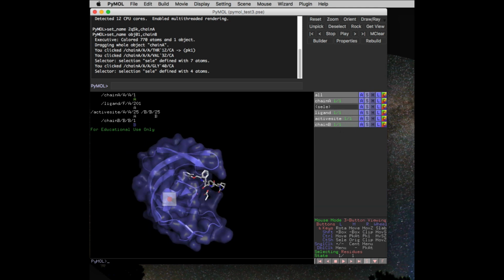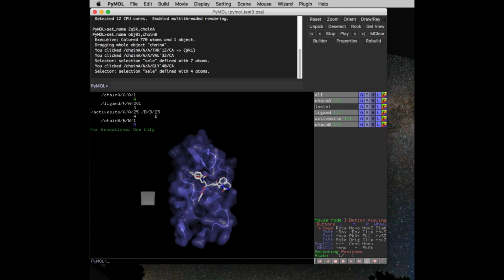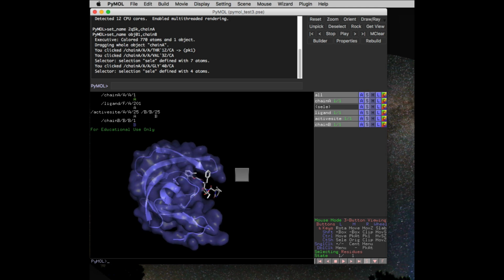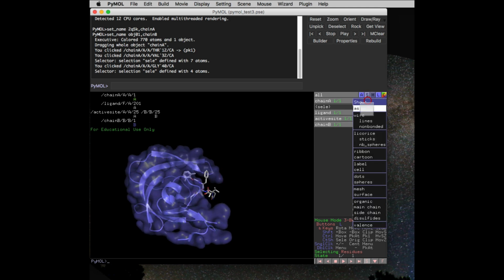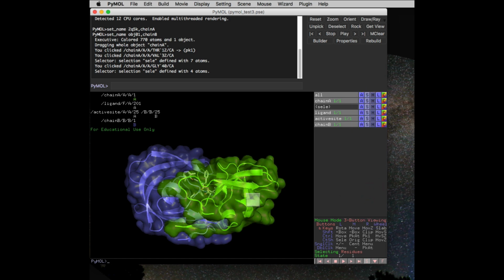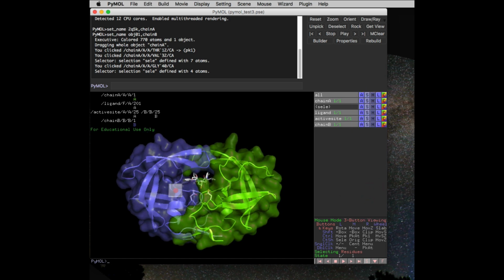We can also just take that molecule away entirely and see the interface of the two subunits, as well as how they interact symmetrically with the ligand. But if you hide it, you have to go through both steps of bringing the entire thing back.